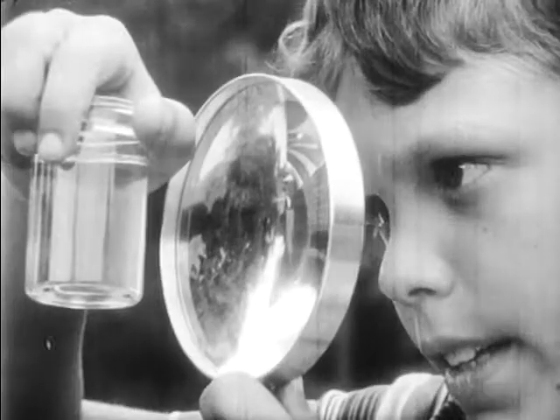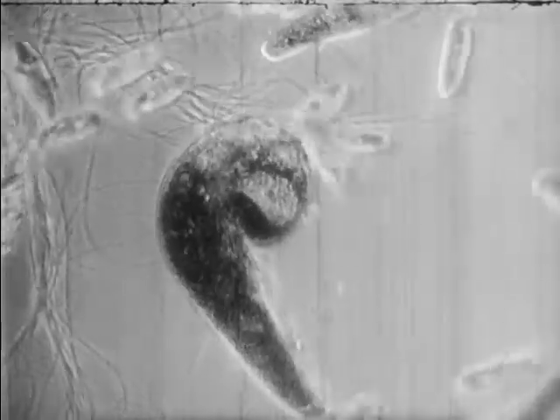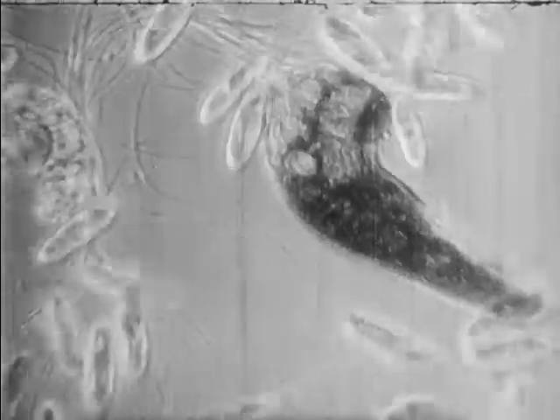Through the lens, we can see shapes and movement. Could these be alive? If we had many lenses working together in a microscope, we would find that these dots look like this. Through a microscope, we can see these things made thousands of times larger than they actually are.